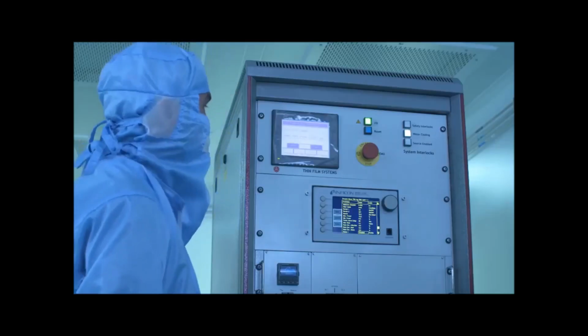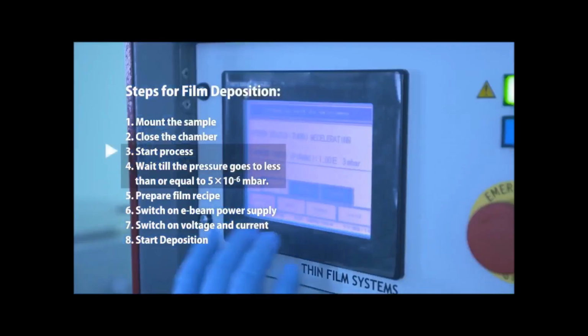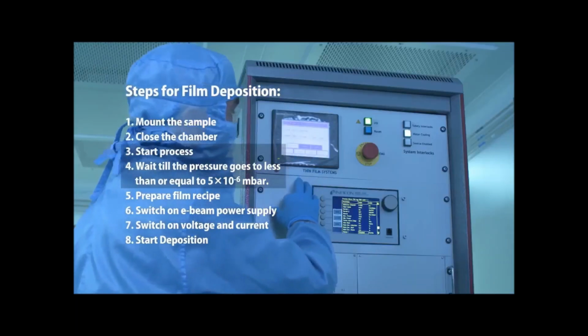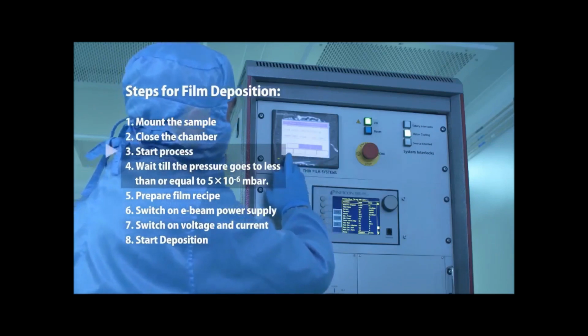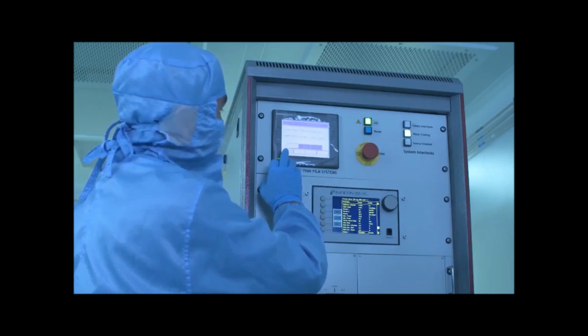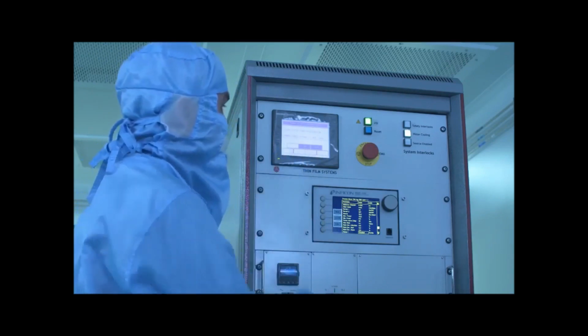Let's start the process here. We have to press the start button here, and it starts the backing pump. So the roughing pump has started. It will bring the pressure from 1 into 10 to the power 3 millibar to 10 to the power minus 2 millibar, and after that the turbomolecular pump will start. We have to wait till this process button becomes active. It will take around 5 minutes.